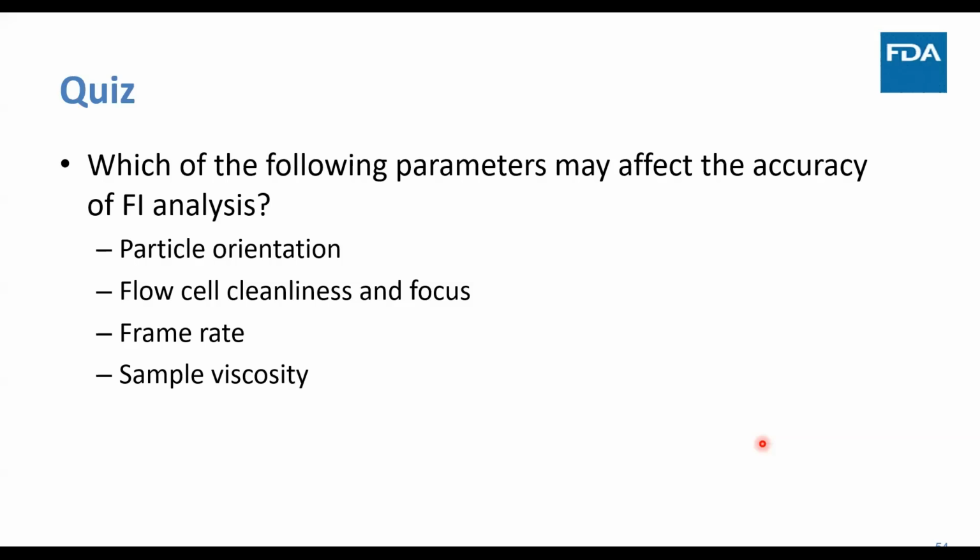I'm thinking this might be our last question. Which of the following parameters may affect the accuracy of flow imaging analysis? This is not a trick question.